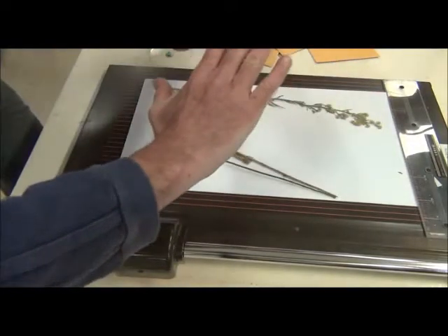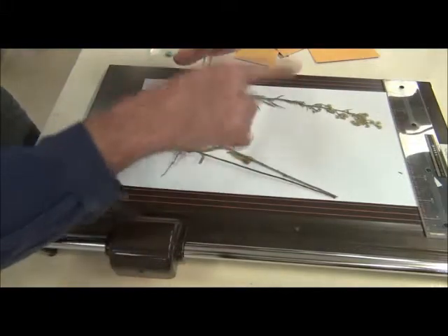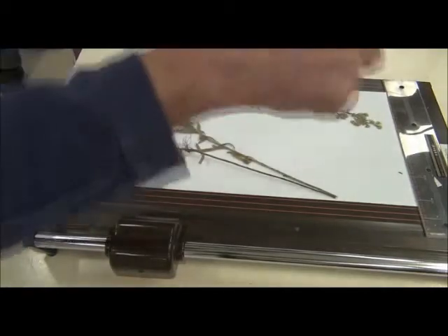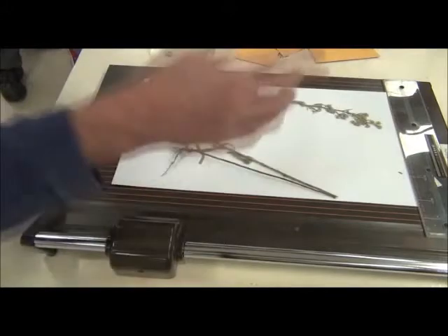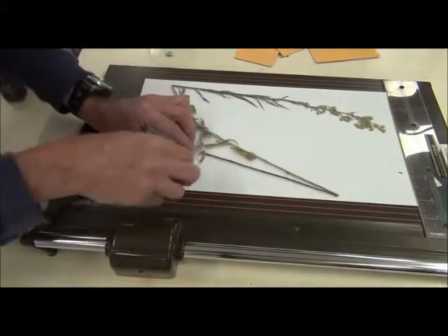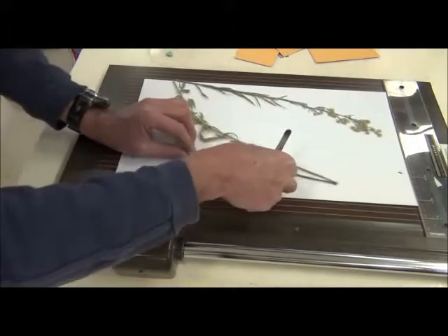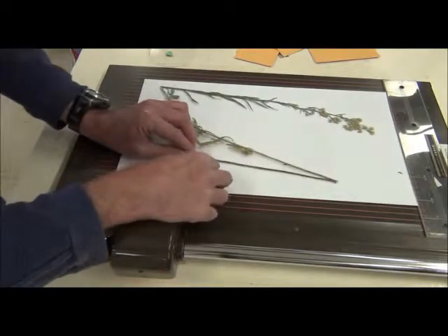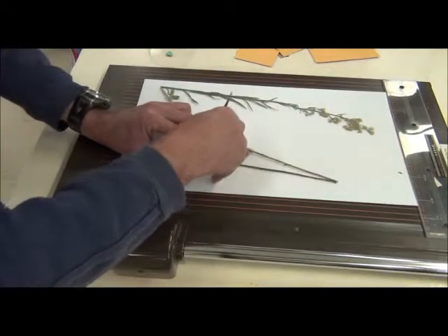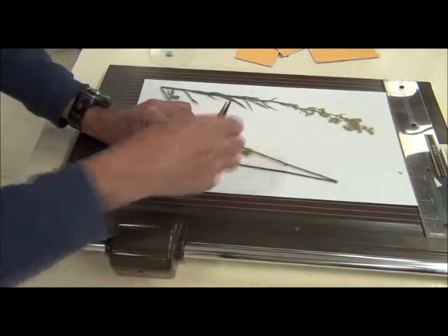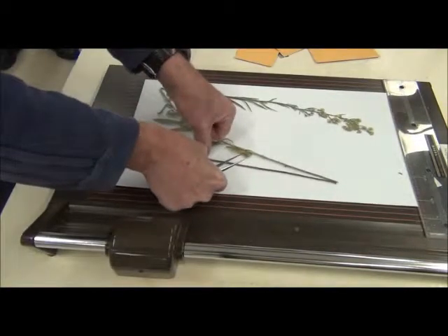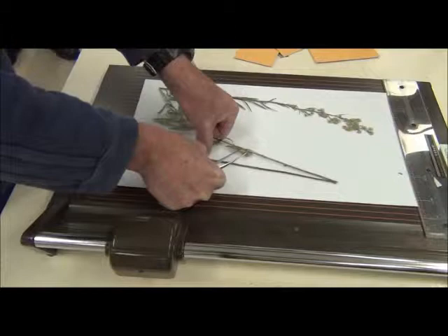What I mean by a tent is where the paper is like this, forming a V over the stem and there are gaps on either side. So I don't want to make an A-frame tent. I want to make it like this, like a U or an N that tightly fits around. So I grab that, it's good to have a pair of forceps or something similar and I can just put that in and over and tuck that in. So I nib and tuck and you see how tightly that's around and I'm going to, just for good measure, I'm going to hold that for a few seconds and sort of count to three.